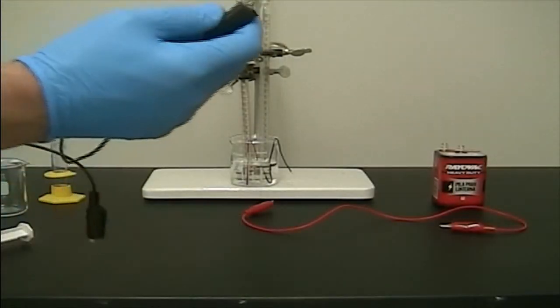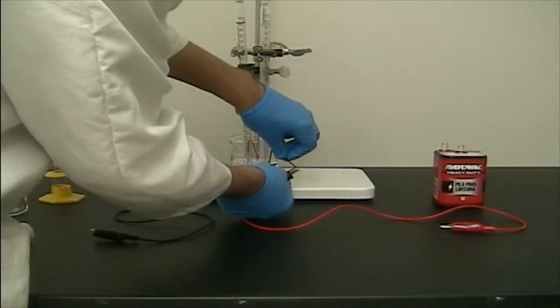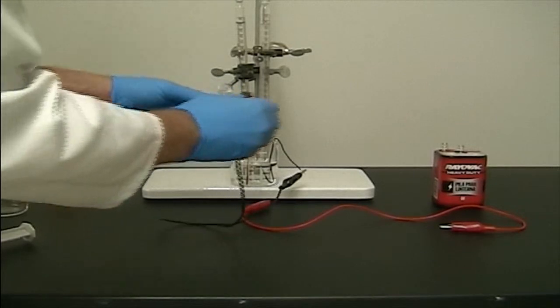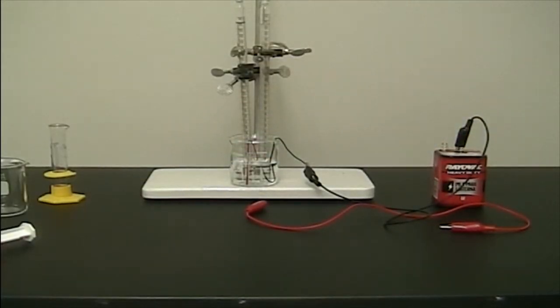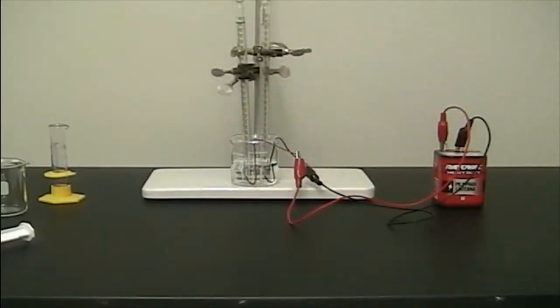At this point, the alligator lead wires were attached to the exposed ends of the electrodes and then to a 6-volt battery, with the black wire being connected to the central terminal, the cathode, and the red wire being attached to the offset terminal, the anode.